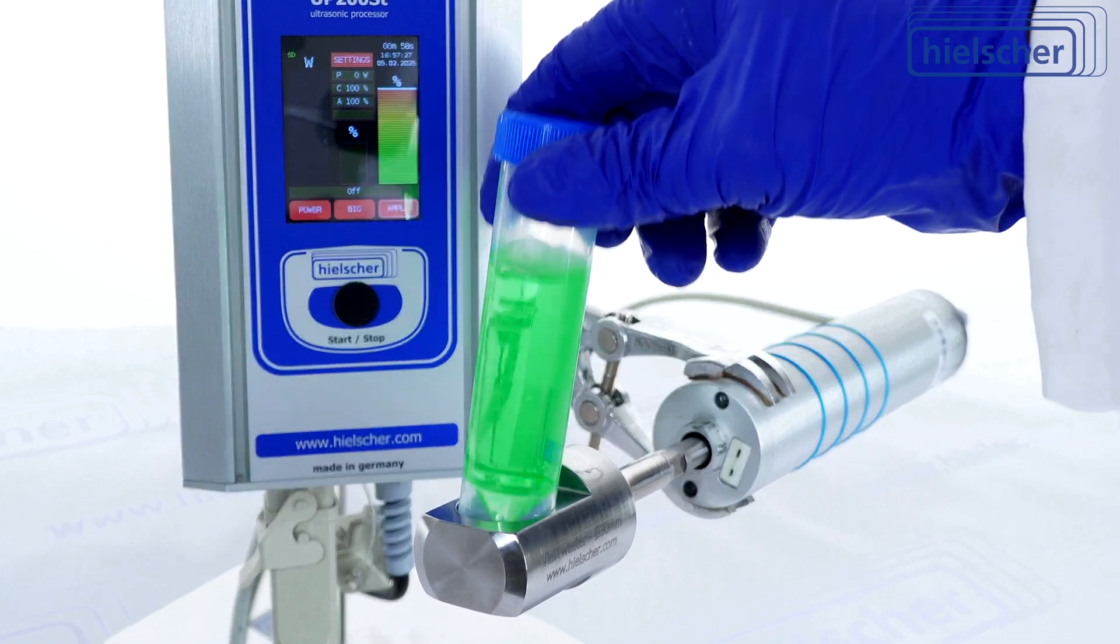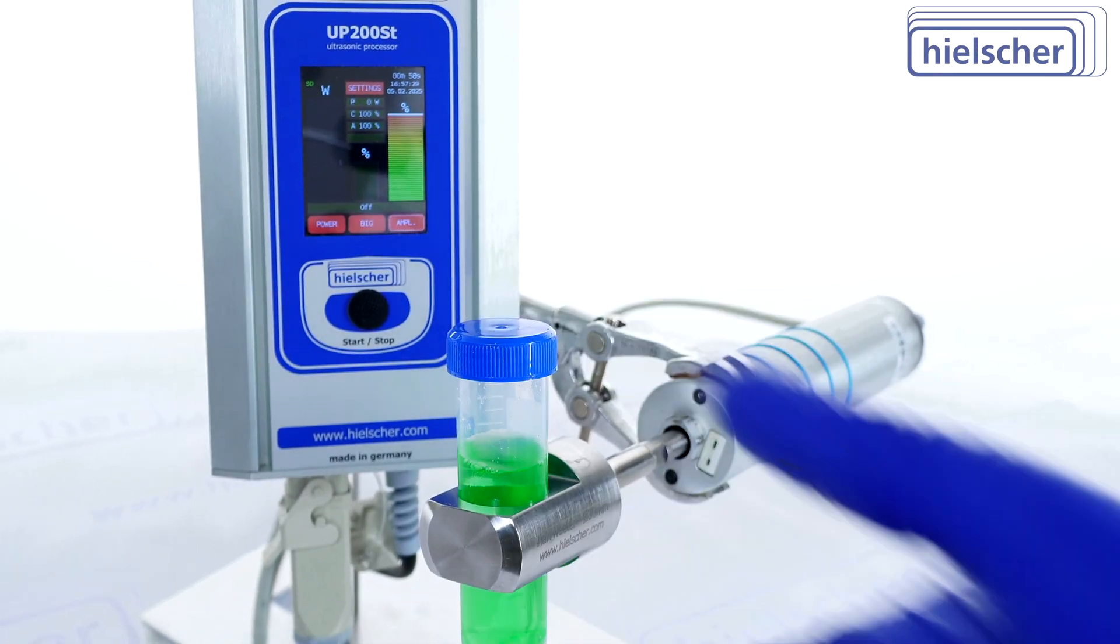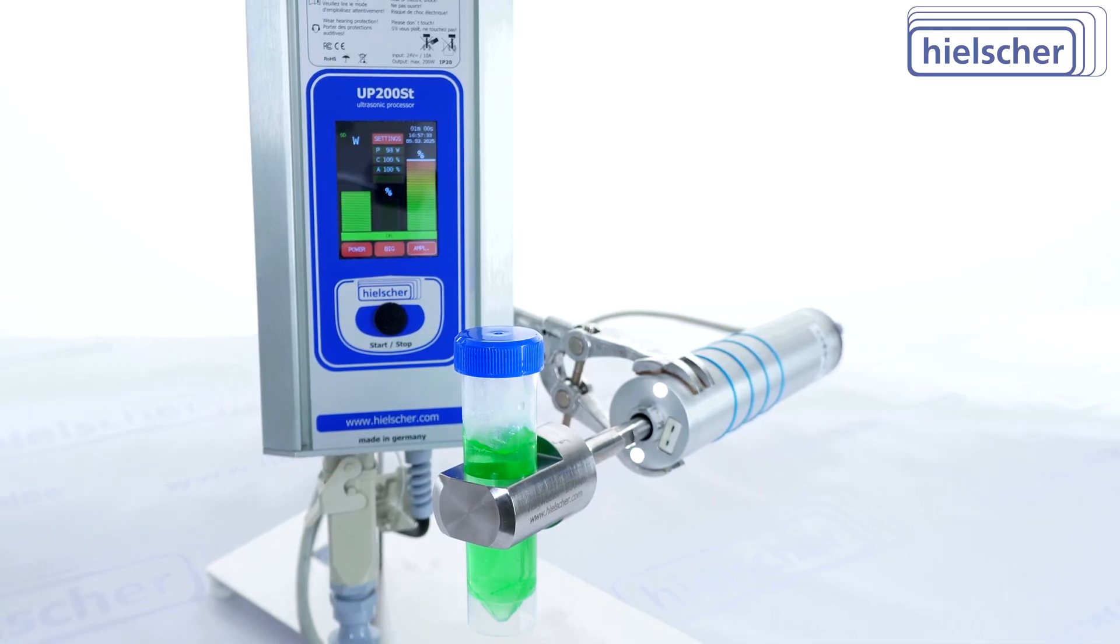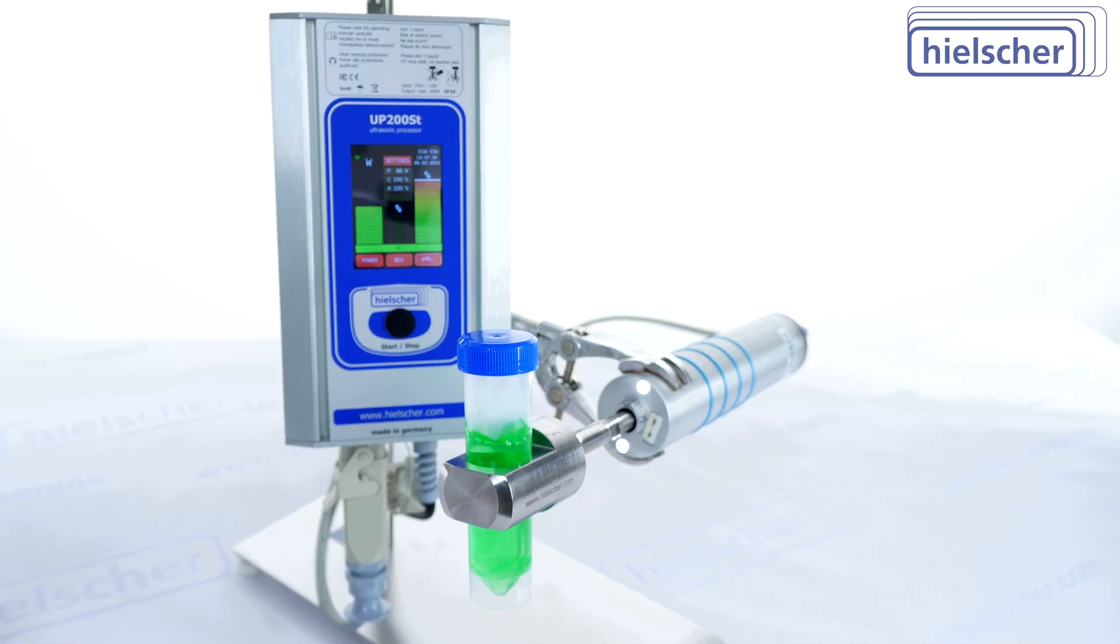In the cosmetics and pharmaceutical sectors, formulators can quickly prepare fine emulsions or liposomal dispersions, achieving consistent droplet sizes and improving product homogeneity.